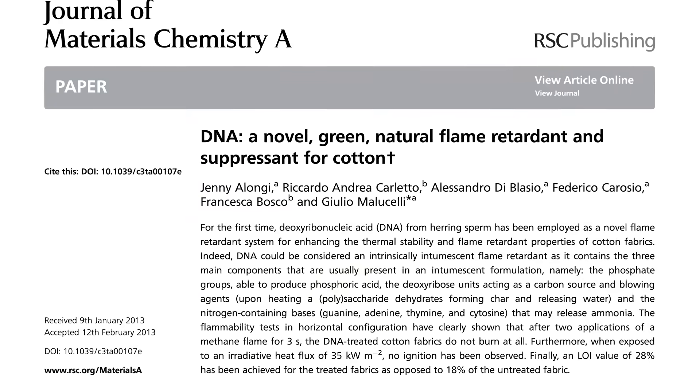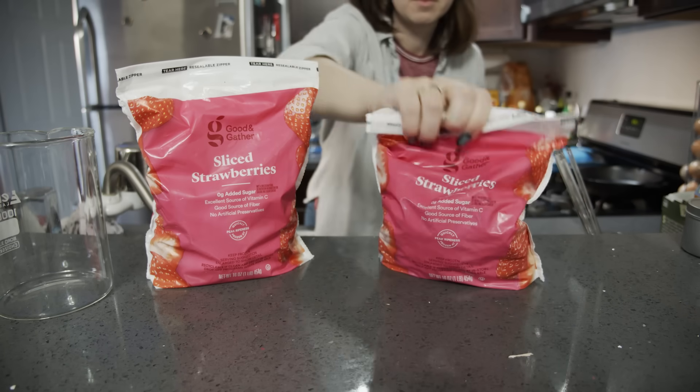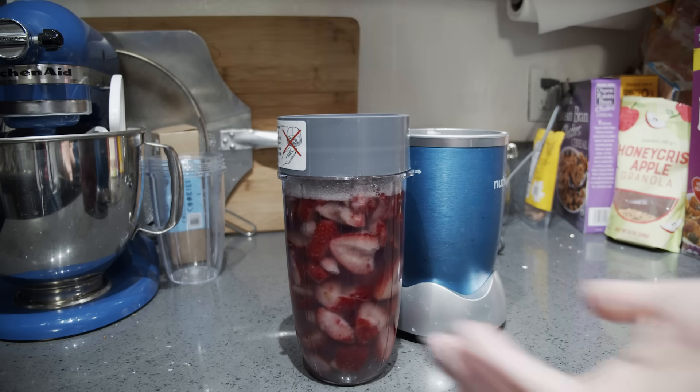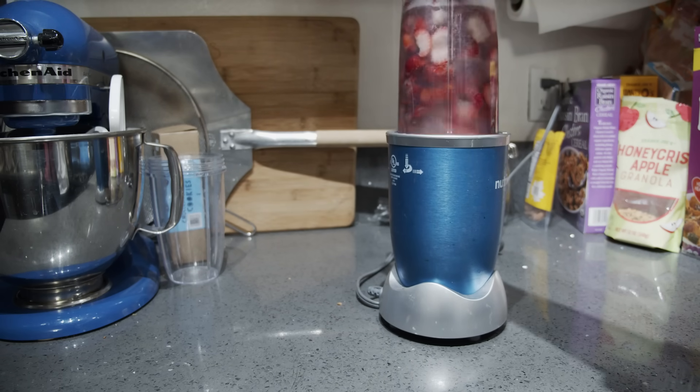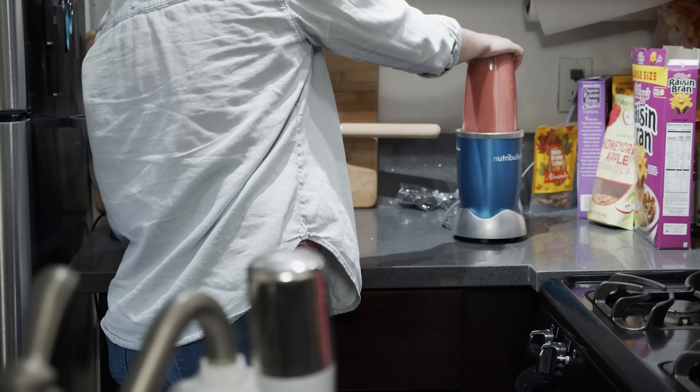So obviously I had to try this out. To test this, I started by replicating everybody's favorite middle school science fair experiment: a strawberry DNA extraction. Except I did this on a much larger scale. The process is pretty straightforward — break apart strawberries by smashing, blending, or squishing them.